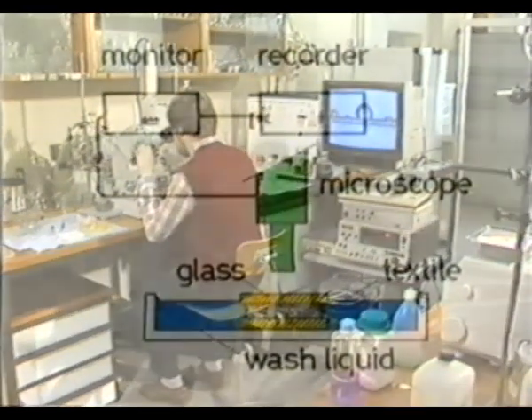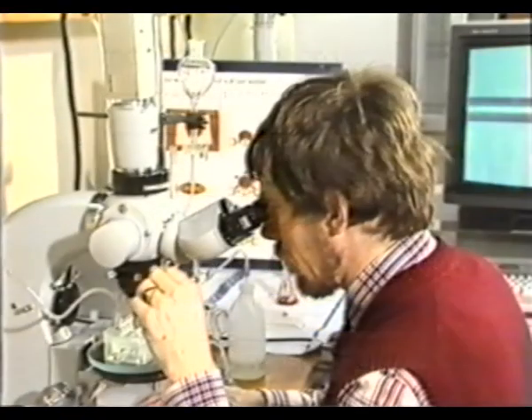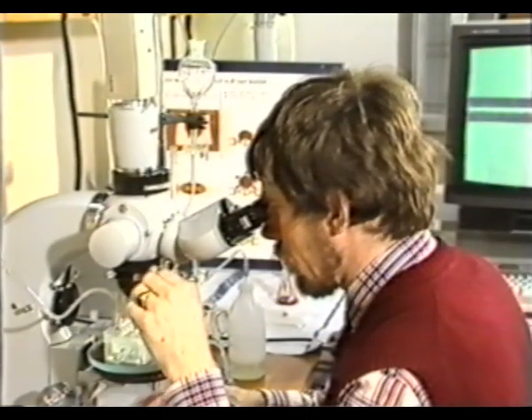A wash liquid flows through the system under various controlled conditions. The processes of soil loosening and removal are shown at 1000 magnification. We will show you some of these processes in more detail, concentrating on fatty soil and protein soil of biological origin.